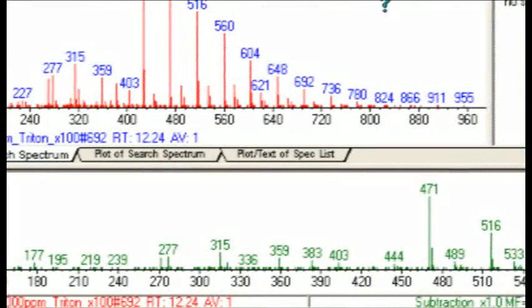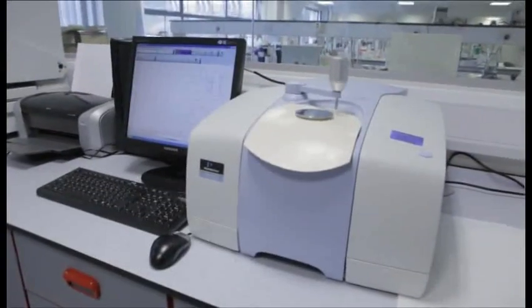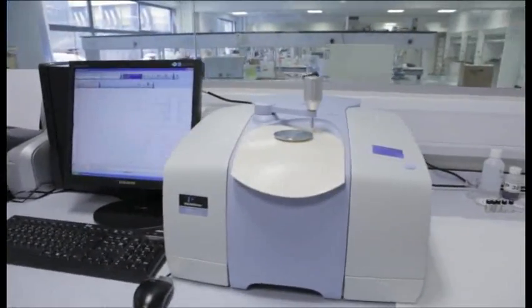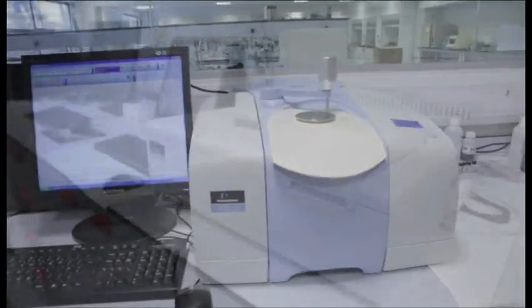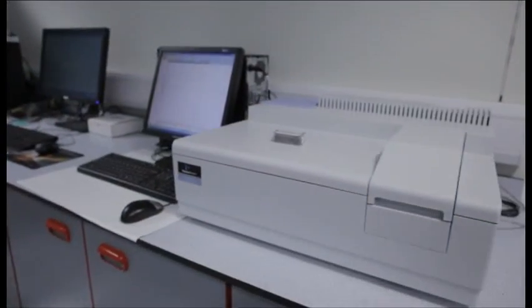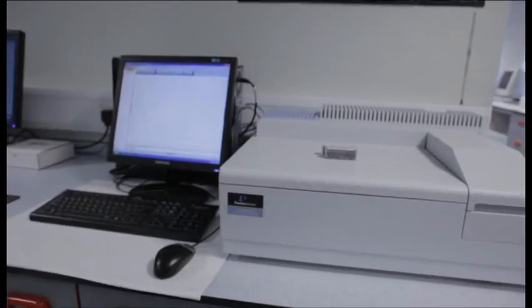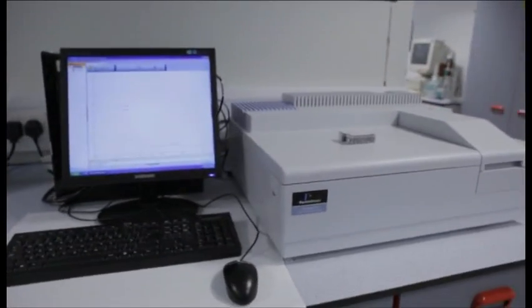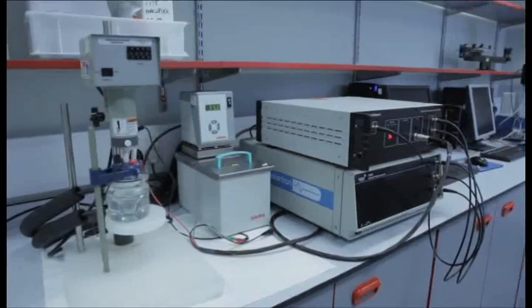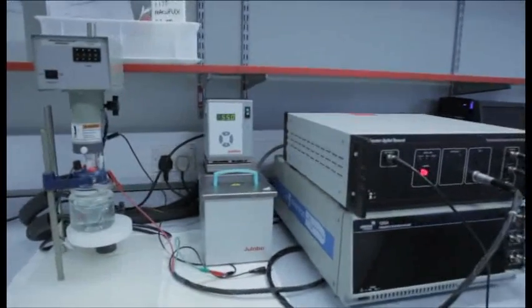FTIR identifies the functional groups in a molecule and can be used for both liquid and solid samples. UV spectroscopy identifies chemicals that absorb strongly in this part of the light spectrum. The potentiostat is used to measure the kinetics of electrochemical reactions.